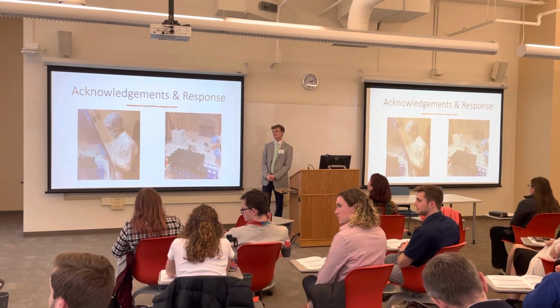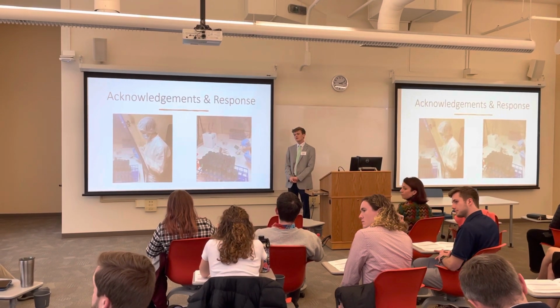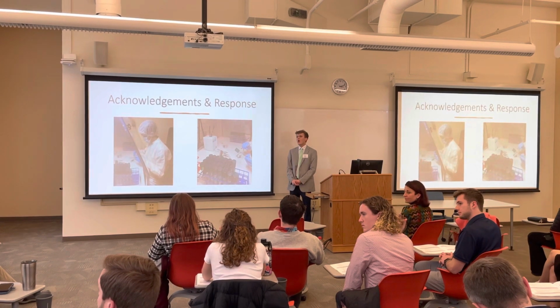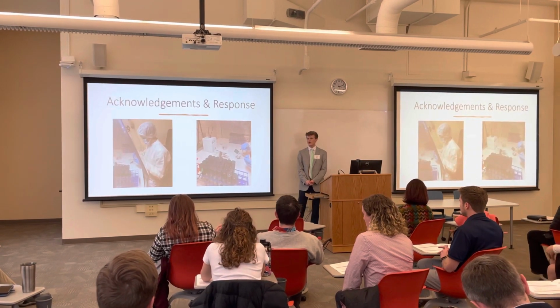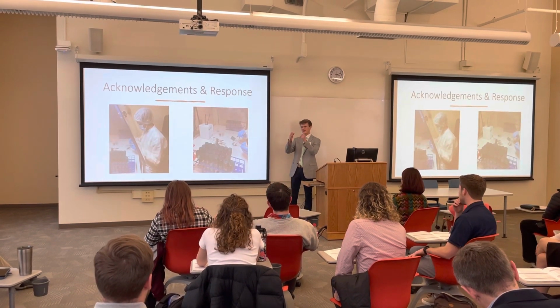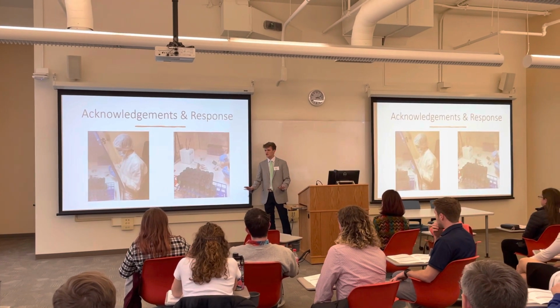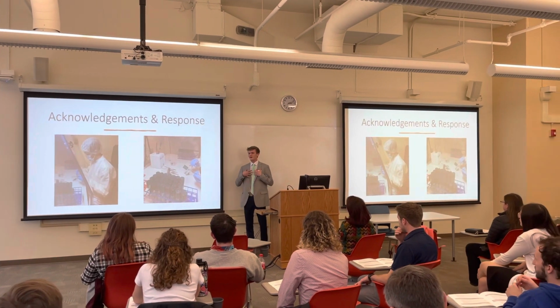Have you tried any liquid culture with the somatic embryogenesis? Because I know they do that for carrots, and they grow it in a shaken suspension. Have you looked into any of that? We're looking into it actually right now. So that is one we are seriously considering. The problem with that is that you don't get that solid suspension, and so it can mess with the fine root hairs. They don't like being touched, which is a problem that I have discovered accidentally when messing with my samples.